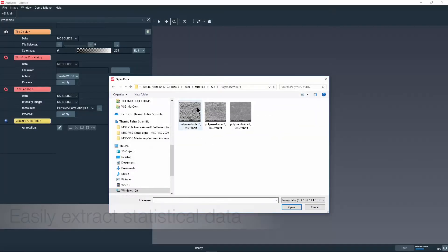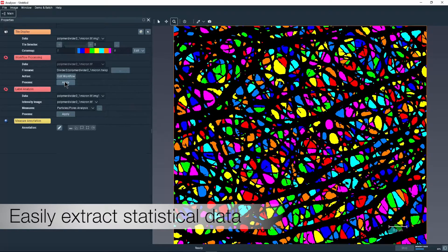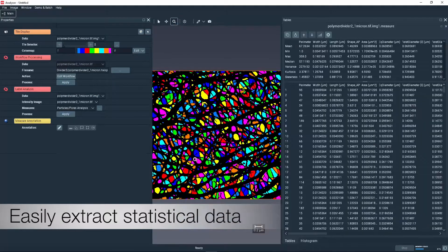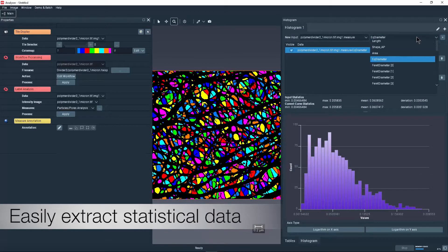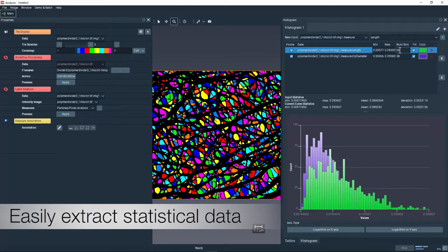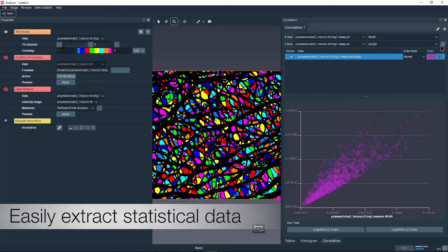Aviso2D software provides an innovative solution for efficient imaging data analysis. Designed with maximum ease of use in mind, Aviso2D software allows people who are not image processing experts to seamlessly classify features and extract accurate quantitative information from 2D image data.